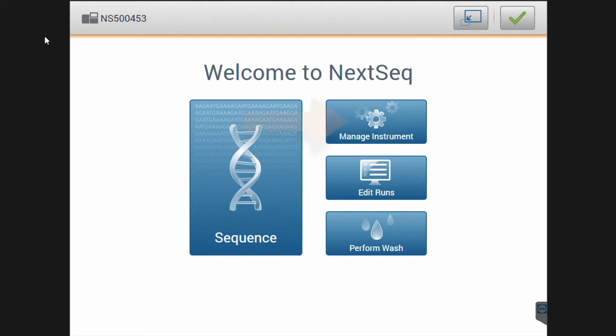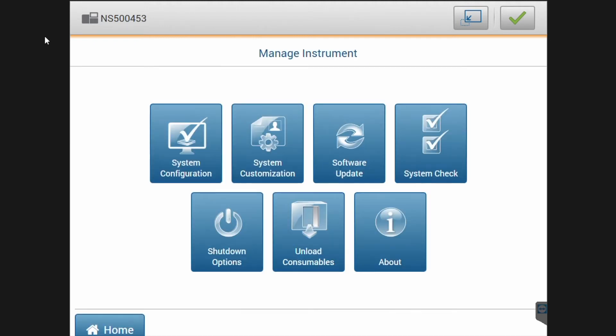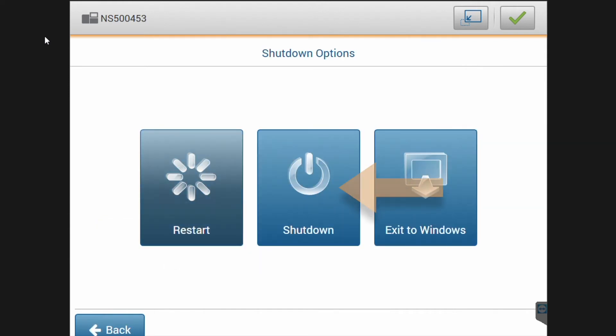please navigate to the Manage Instrument menu in the control software. This can be done from both the DX side and the RUO side. Depicted here is the RUO side. In the Manage Instrument menu, please select Shut Down options.